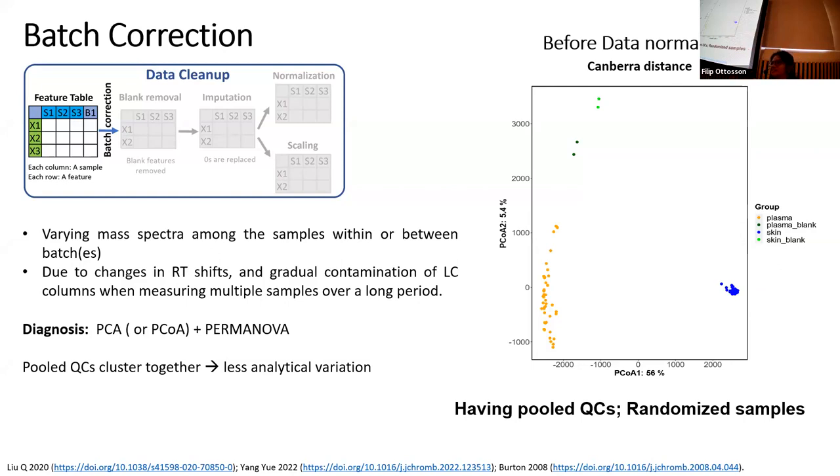Fortunately, it did not affect the question that we were asking, especially about the diphenhydramine drug. So we didn't touch anything. We didn't perform batch correction. I just wanted to give you an idea that if you observe batch effect, you might need to do it.